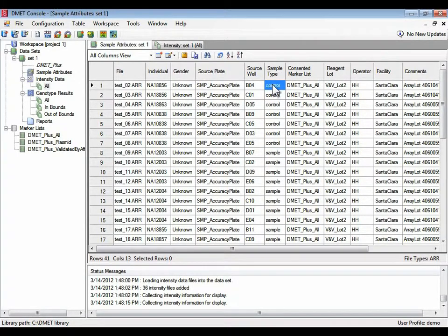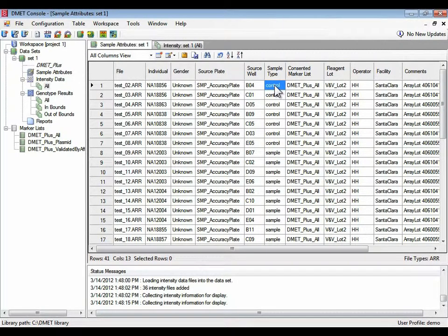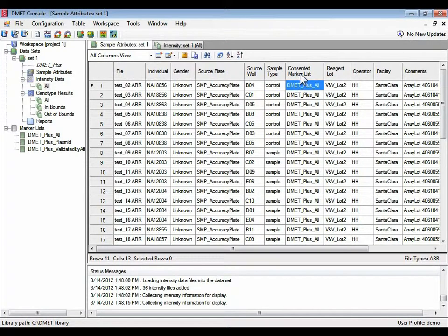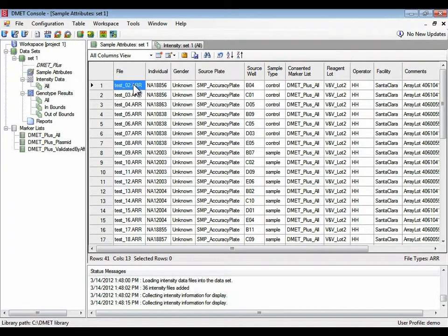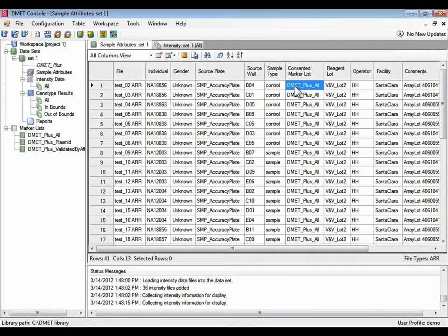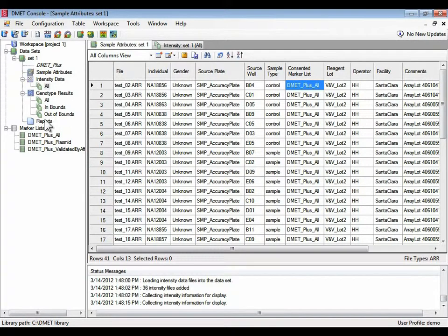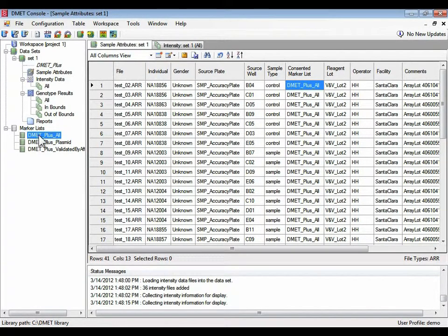This is one of the two required fields, which explains why the ARR file is needed. The other required field is the consented marker list. The consented marker list is what is the set of markers that are allowed to be genotyped for this sample. The actual set of markers that's in DMIT plus all shows up in this marker list DMIT plus all, which I'll show later.